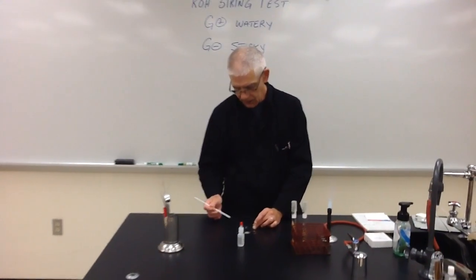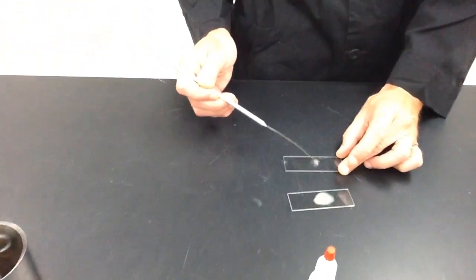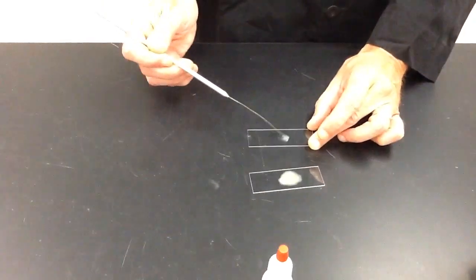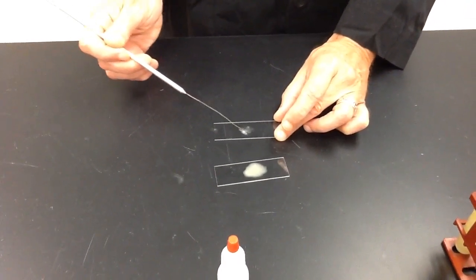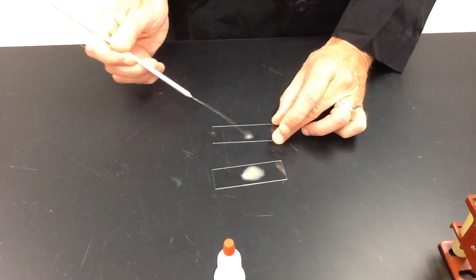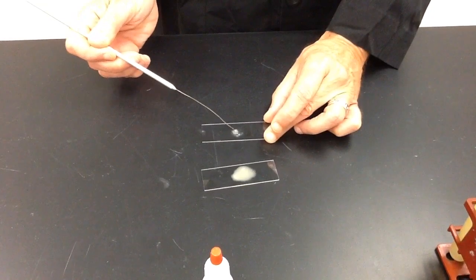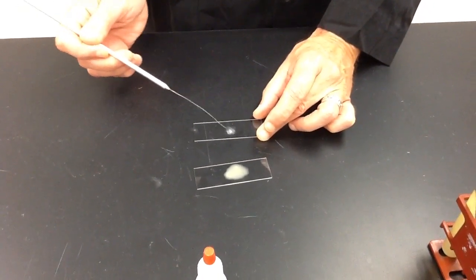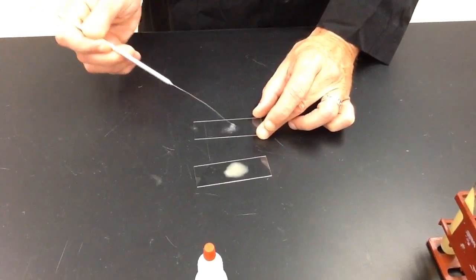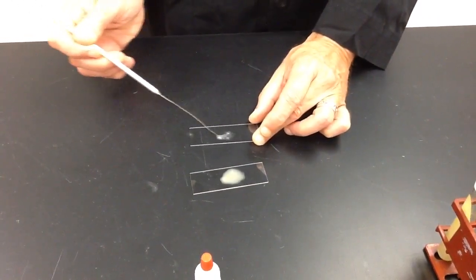And as we start to do this, what you should notice is that the bacteria is starting to get really sticky. If you notice, as I'm going around, it's sticking right to the loop. And then if you pull up, it will form a string that comes up. And that happens pretty quickly. So you notice how that sticks, so that's your gram-negative.